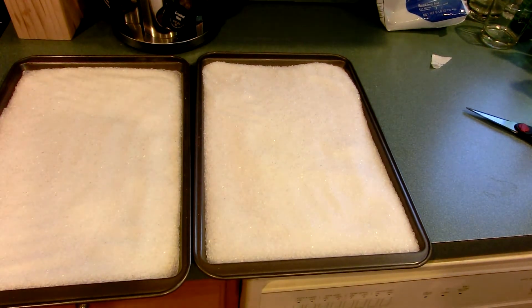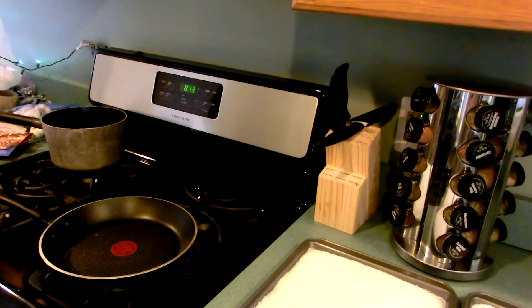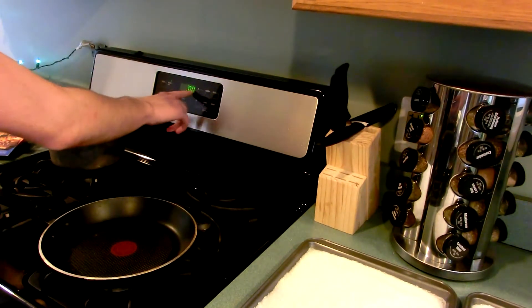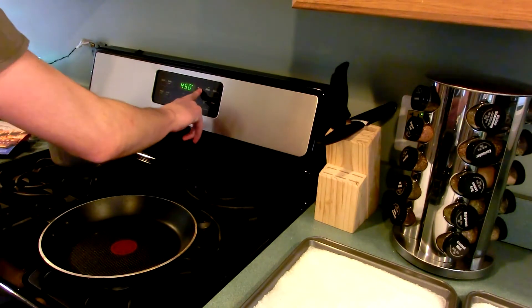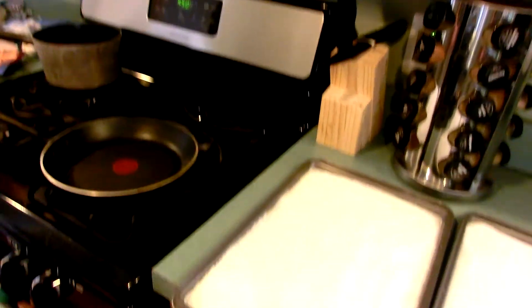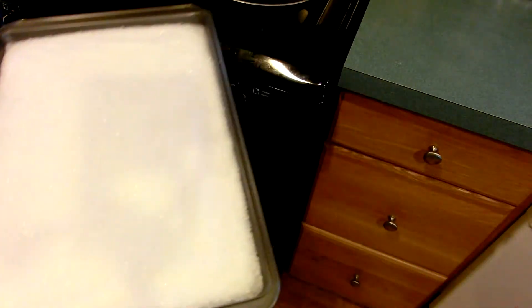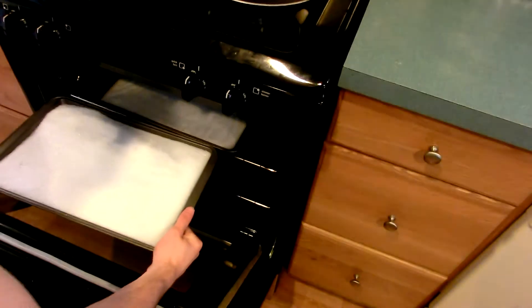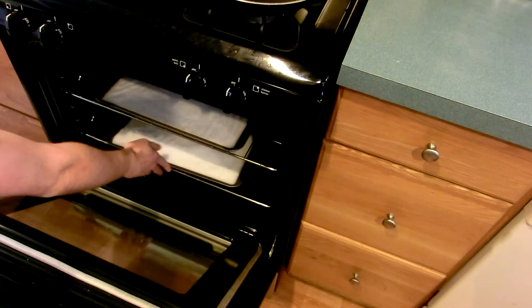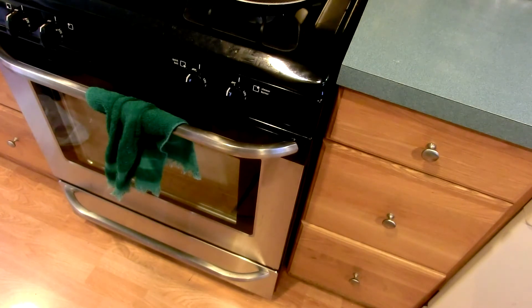So all we need to do is turn the oven on and put it in there. For folks living in the United States, a good temperature would be 450 degrees Fahrenheit. We'll simply pop these in, close the oven, and come check on this in about an hour.